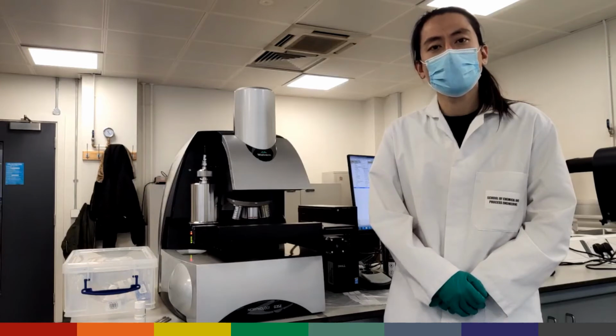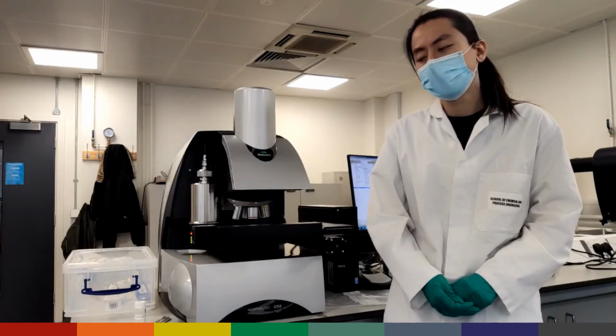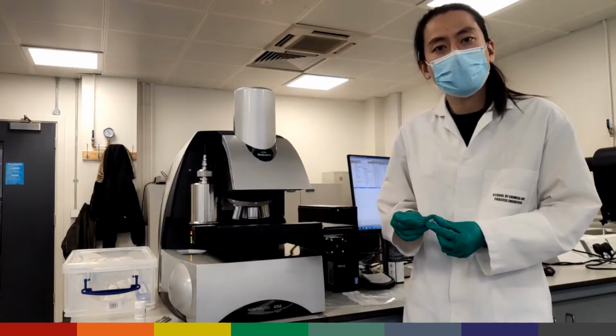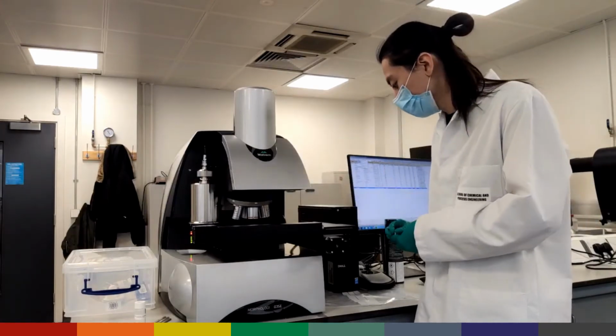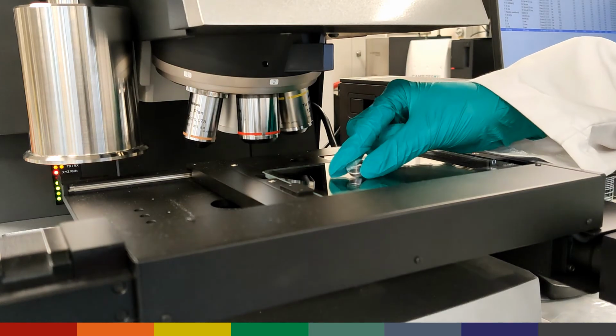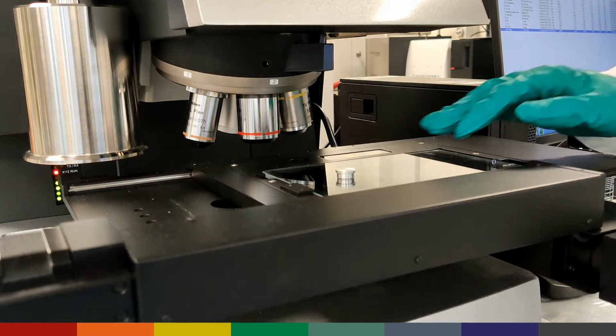Our experiment today is about characterizing the adhesion of powder on the substrate. What I'm going to do next is to disperse some powder onto the SEM stub with the help of the Morphologi G3. Let's put the SEM stub on the glass plate and tell the Morphologi G3 to disperse some powder sample on it.